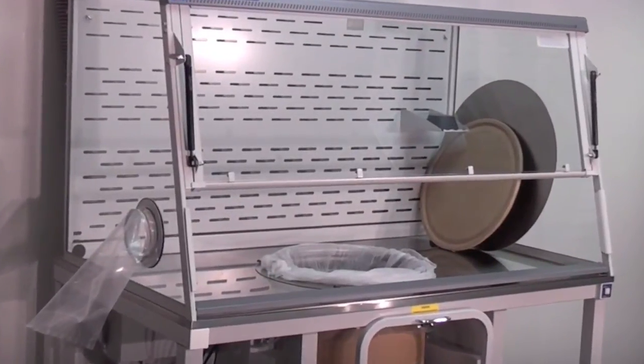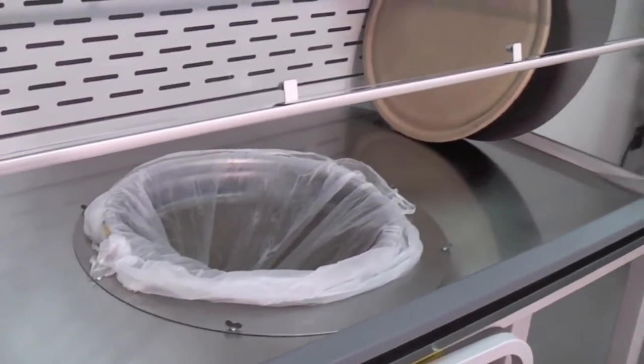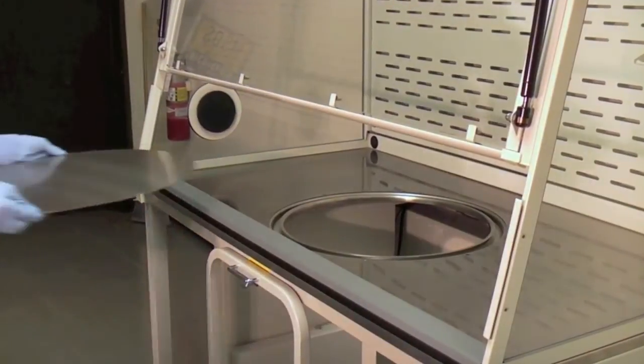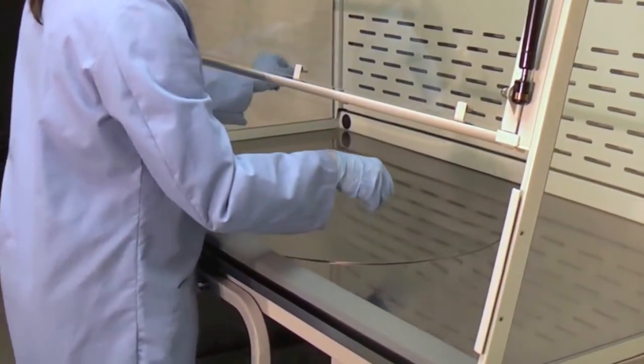The unit is now ready for use. If a bulk transfer is not necessary, secure the access opening cover to provide a flat surface and continue with your procedure.